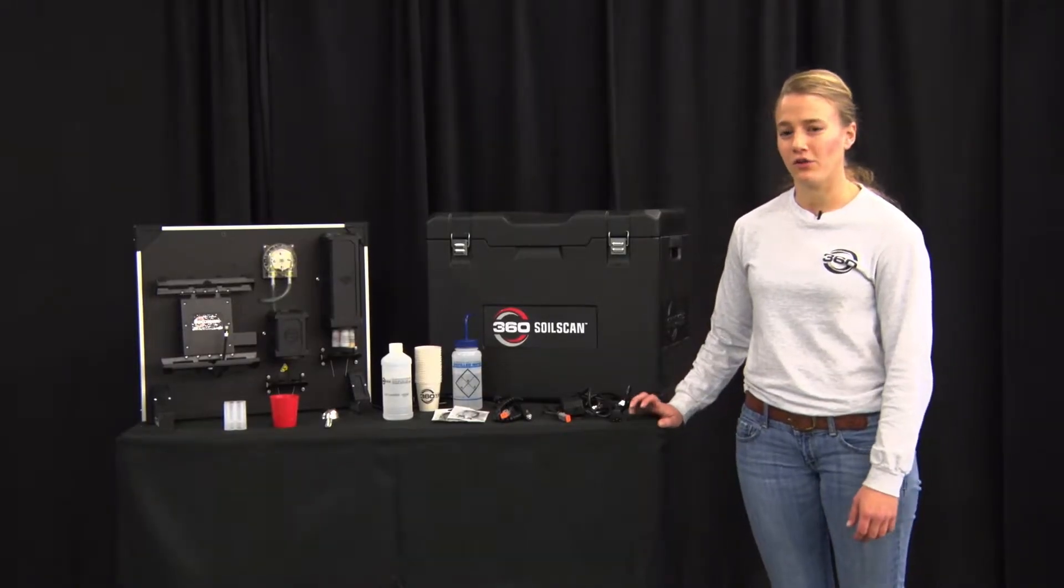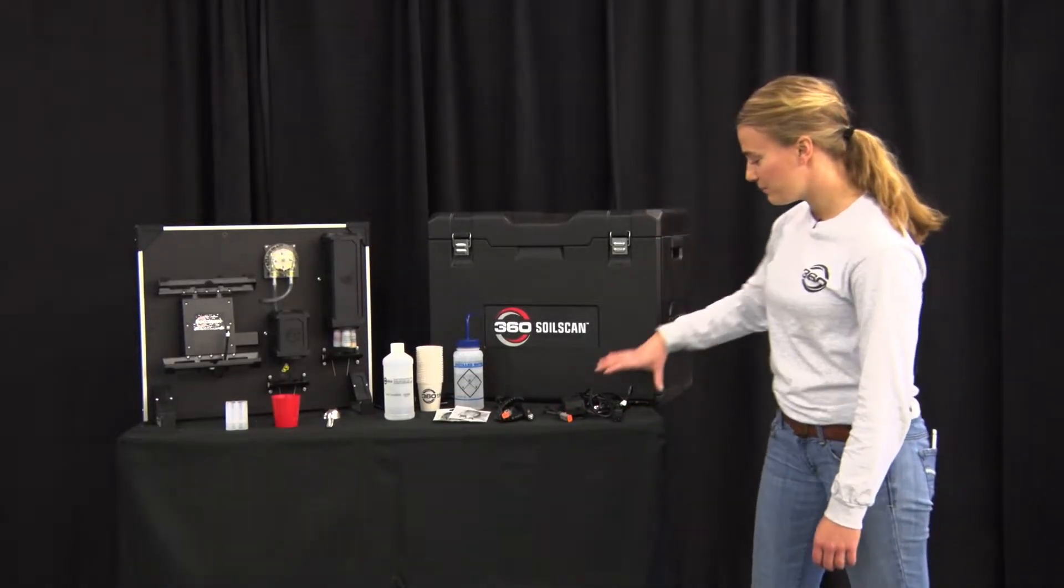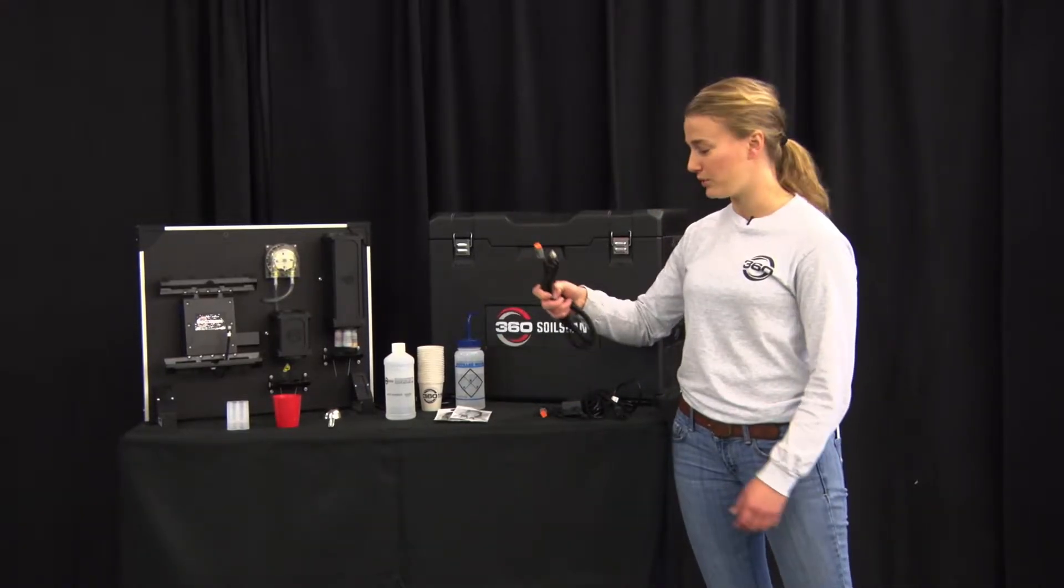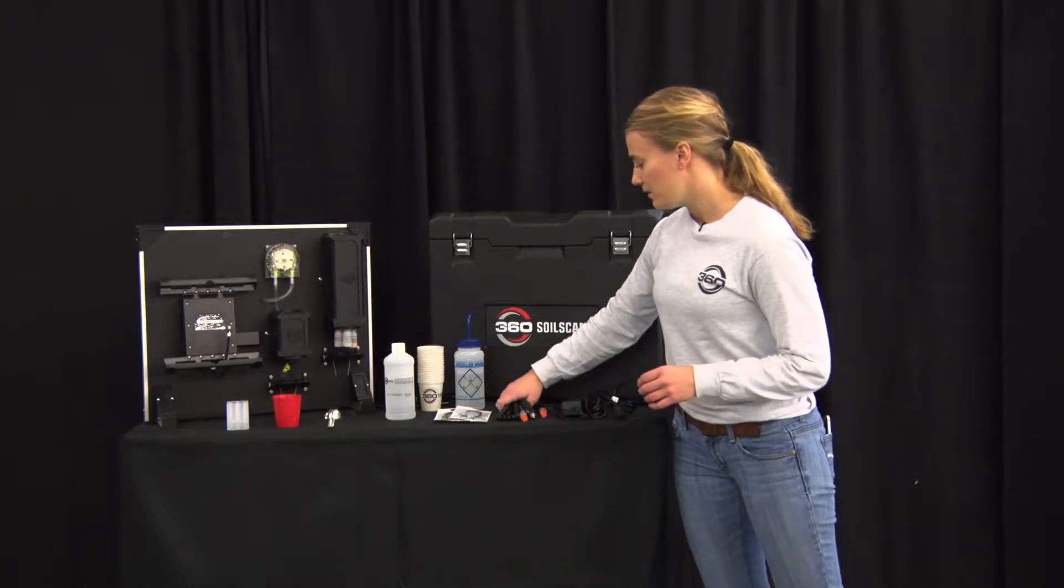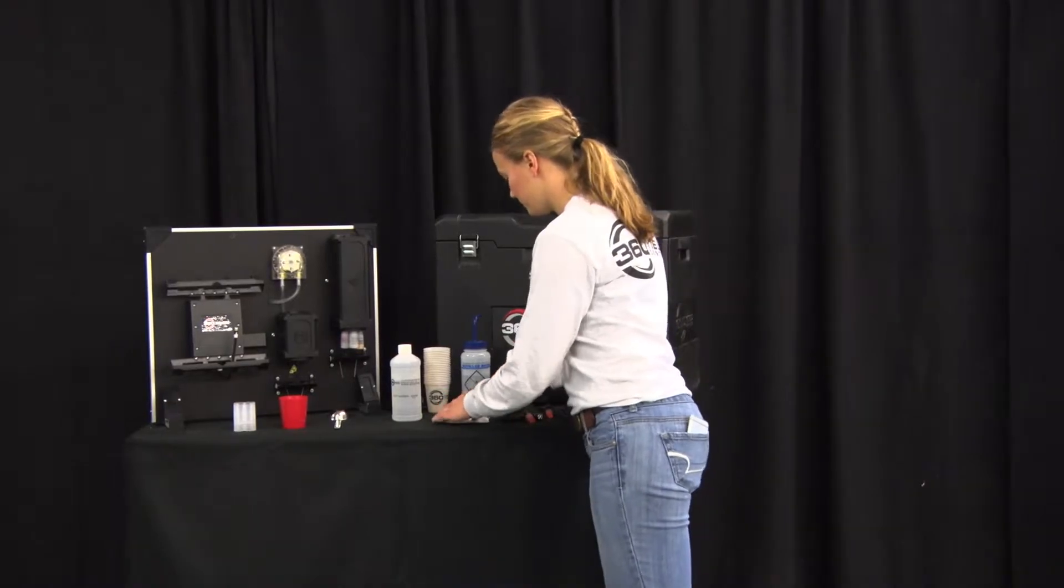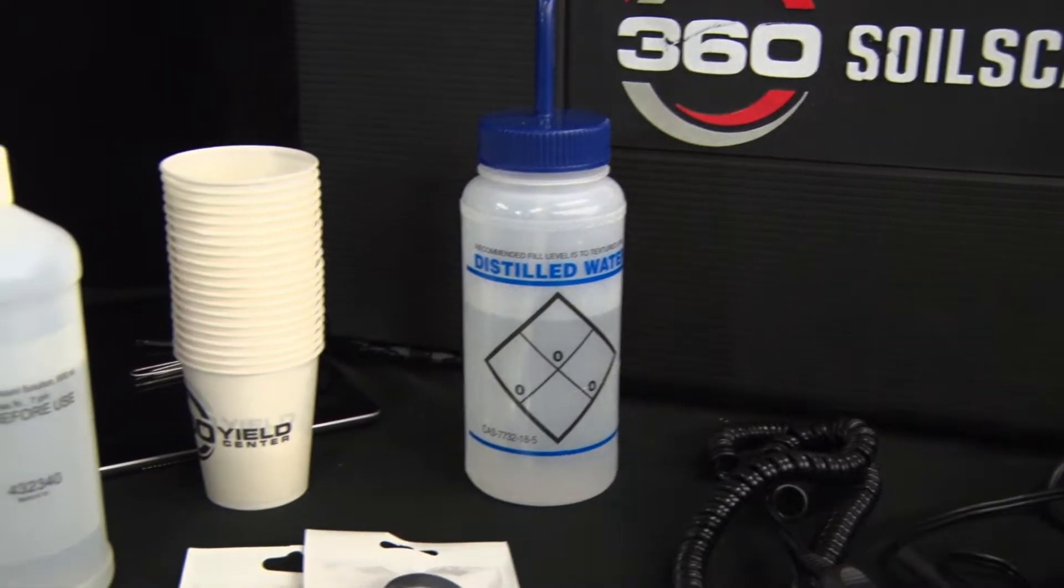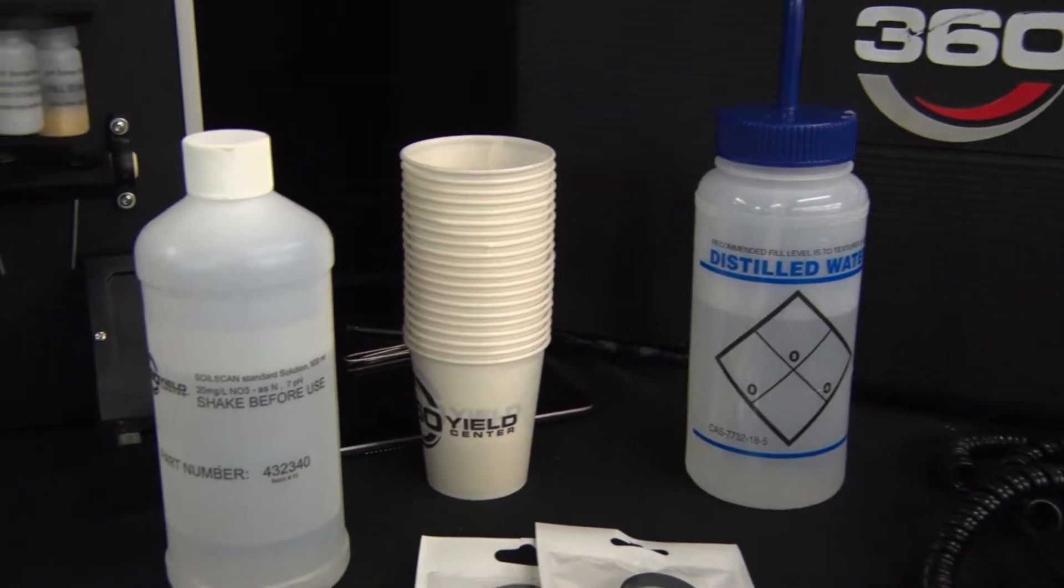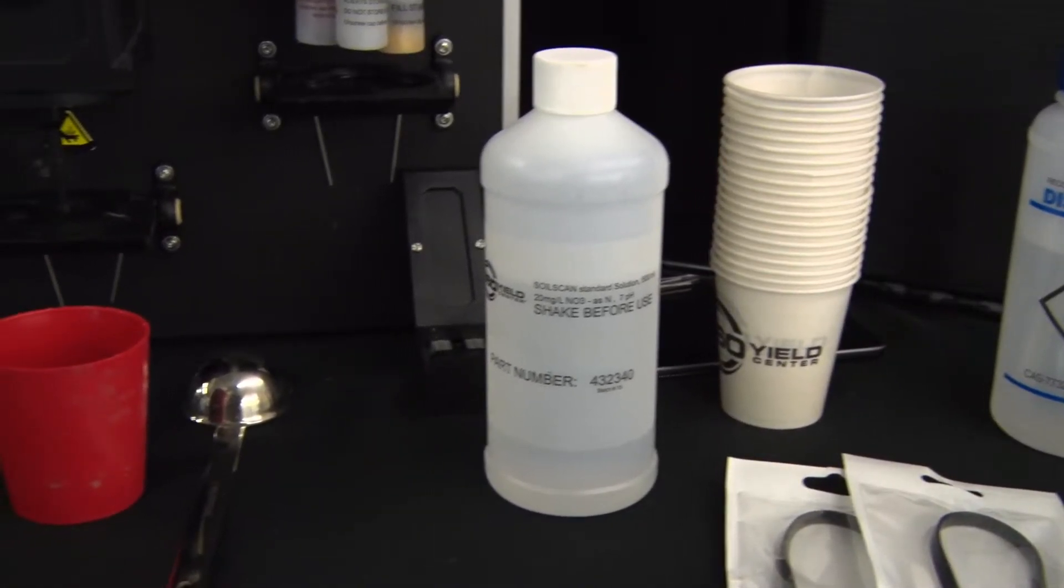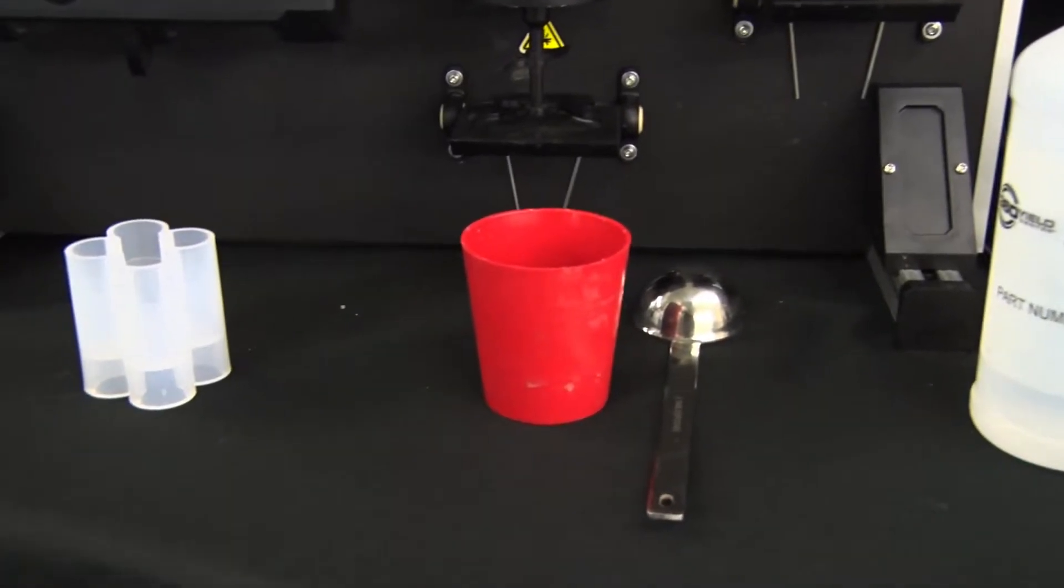On the table here are all of the basic components that will come with your SoilScan. The case, power cables, both 110 volts and 12 volts to be plugged into a cigarette lighter, charging cables for your iPad, a cleaning container, there will be 50 Dixie cups, a bottle of standard solution, a scoop, a mixing sleeve, and the calibration bottle.